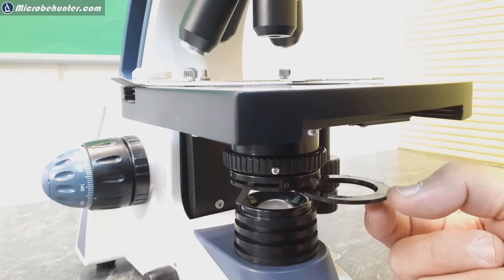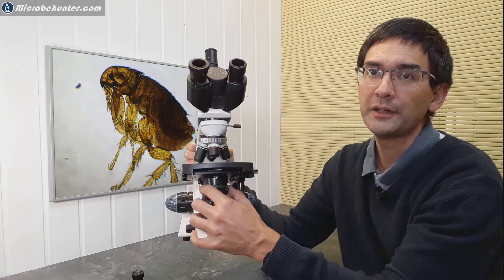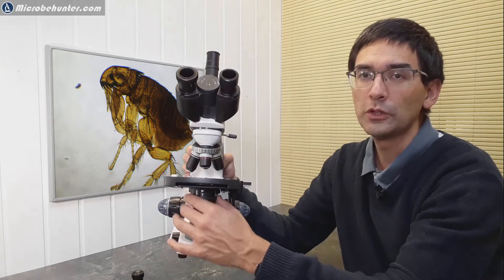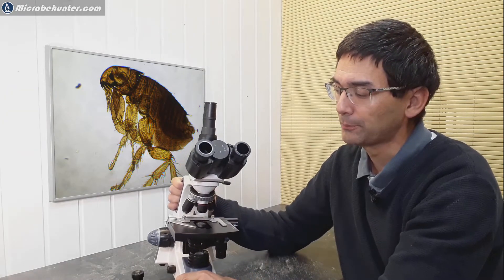Some other microscopes also have a knob that you can turn, but here the condenser can be rotated up and down or moved up and down by simply turning it here.